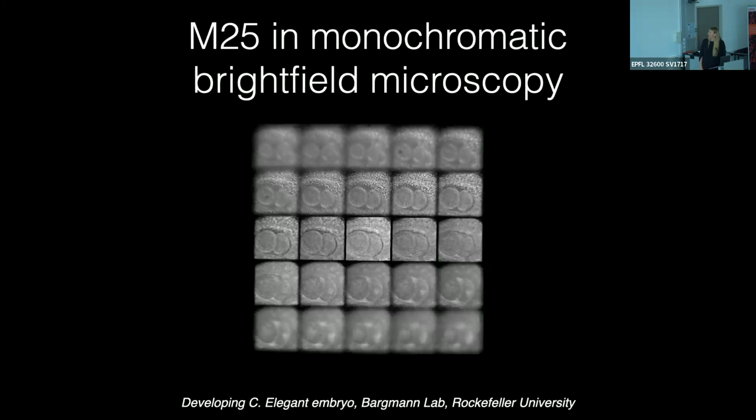There is one thing about this though. If you don't have chromatic dispersion correction, you're imaging monochromatic light. And when you think about bright field, you think about white light. But bright field doesn't have to be white light. You can put a laser line filter in your white lamp, and you can do bright field with monochromatic light. So we did some embryonic imaging at the Woods Hole and also in Corey's lab with this 25 plane single camera microscope. And I think people should do more bright field imaging.